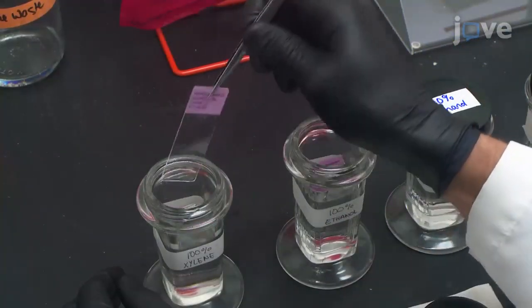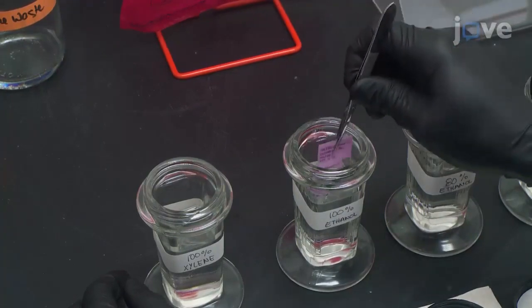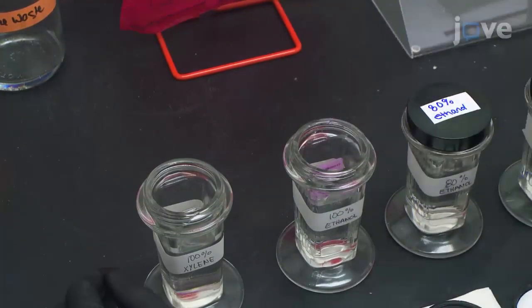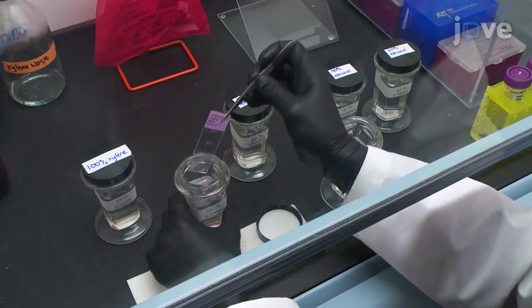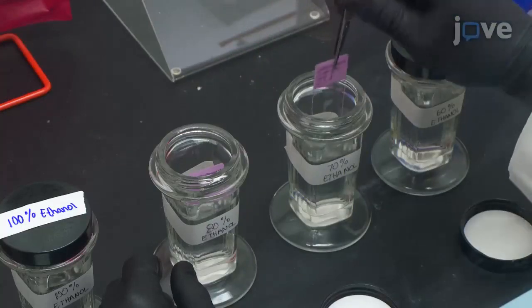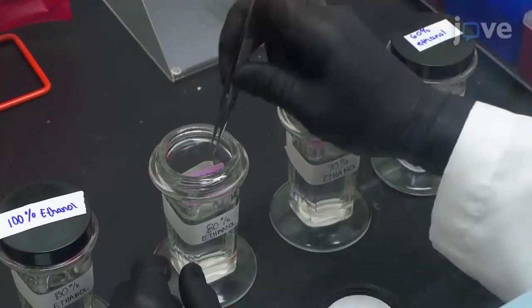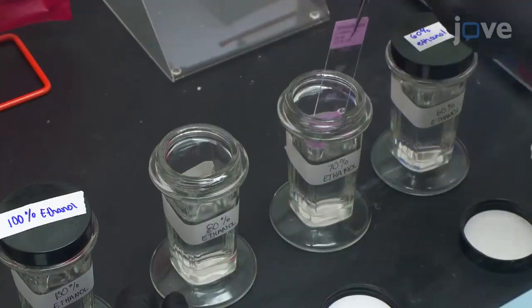First, transfer the slides to the Coplin jar containing 100% ethanol and allow them to soak for 10 minutes. Then, transfer the slides to another Coplin jar containing 100% ethanol. Repeat this process with each of the Coplin jars in decreasing order of ethanol concentration.